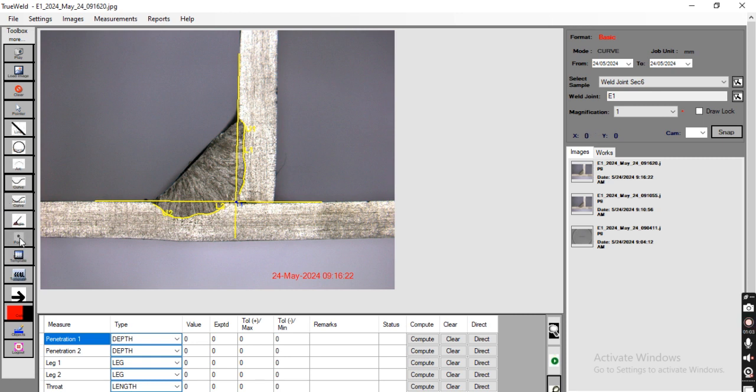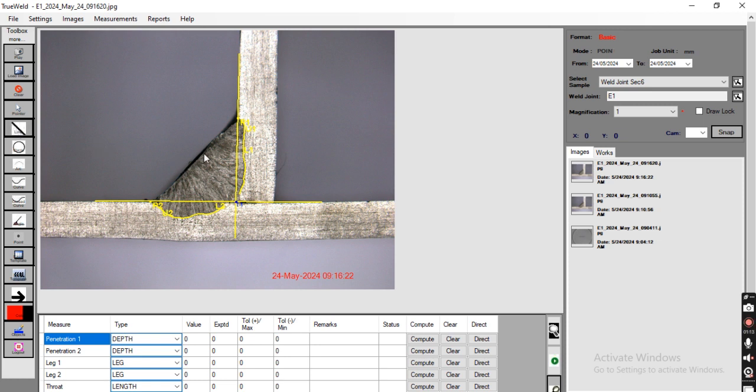Now I am going to use the point command for leg measurement. Again going to use the line command for throat measurement.